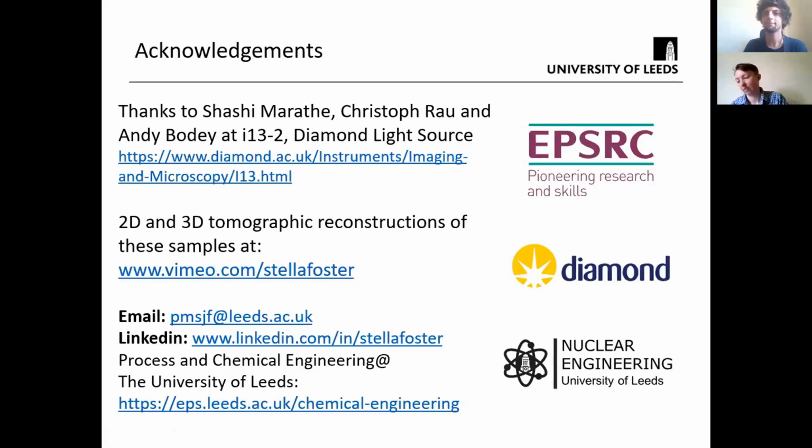Yes, I have a question. This is Hugh McLaughlin from America. Could you comment a little bit about the method to introduce the zinc chloride into the sample? Was it prior to doing the pyrolysis step, and then the pyrolysis step was identical from there out? So just some insights as to how the sample's created.